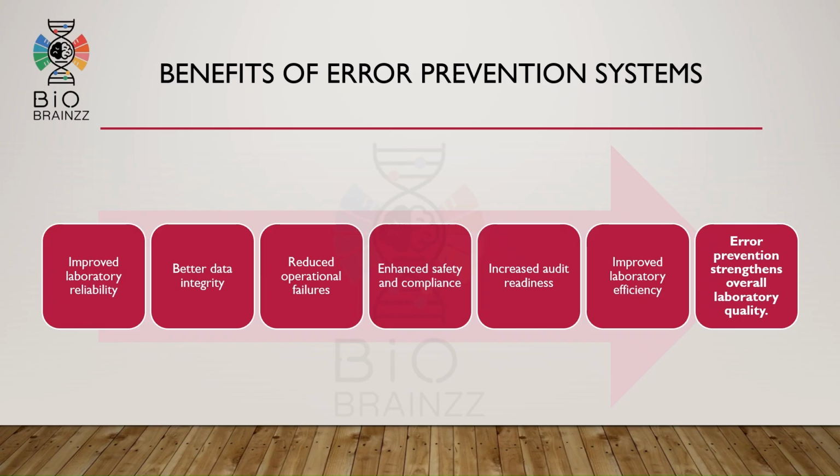Effective error prevention systems provide many benefits. They improve laboratory reliability, strengthen data integrity, reduce operational failures, and enhance safety and compliance. They also improve audit readiness and increase laboratory efficiency. Overall, error prevention strengthens laboratory quality systems.